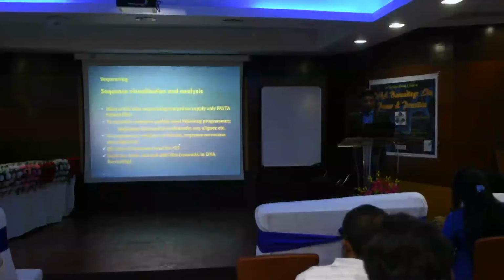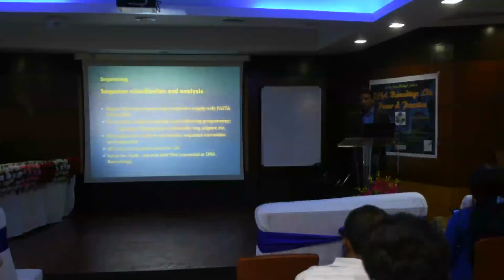I am putting the QV value at 25, which is very low, because a lot of laboratories do not have a sequencing facility, so they should not fight with their facilitators. That's why I am putting 25, because they will give around 20 to 25. But 25 is not a good quality sequence. You can use a higher one.